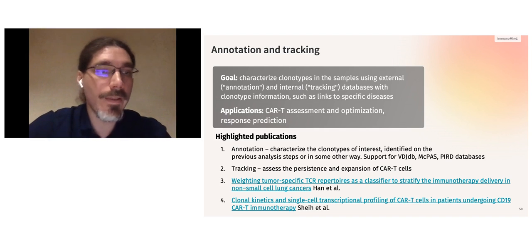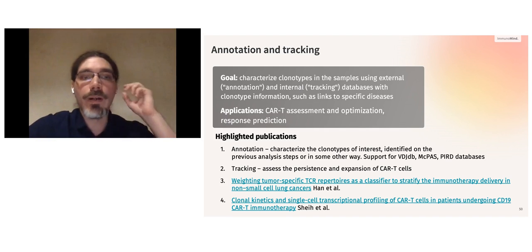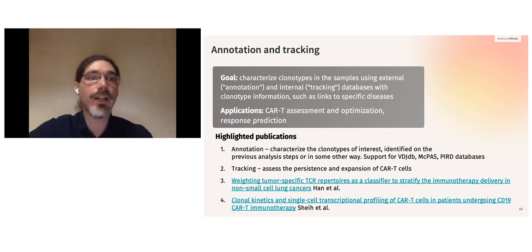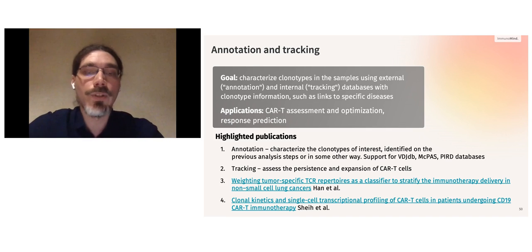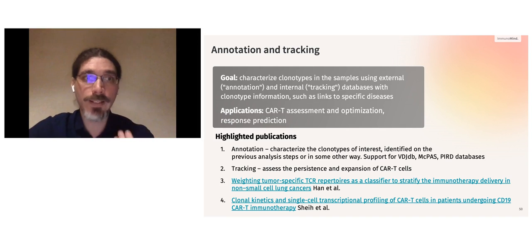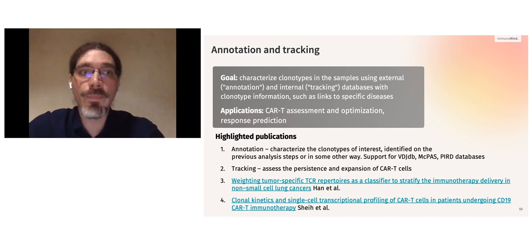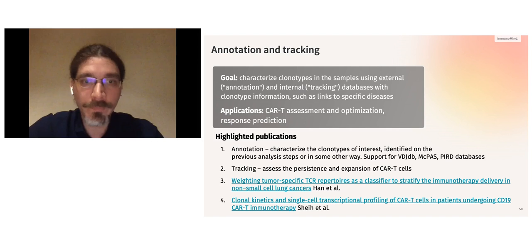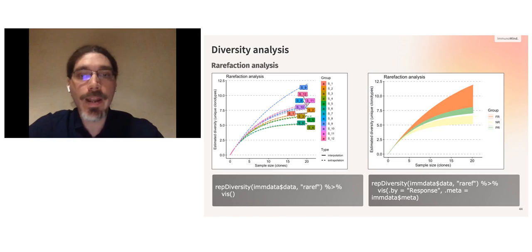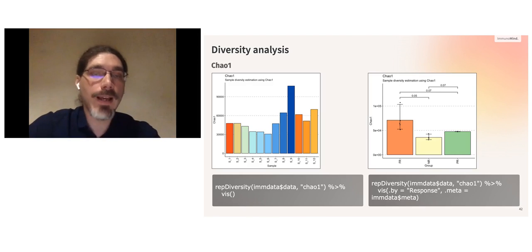So the question is, can the same methods be applied to B-cell receptor sequencing? Any questions regarding analyzing B-cell data? Yes, of course. I just have examples about T-cell receptor repertoires, and I just provide you these foundational methods for analysis of any immune receptor repertoire data. The general caution here is that you need to be careful with applying them.